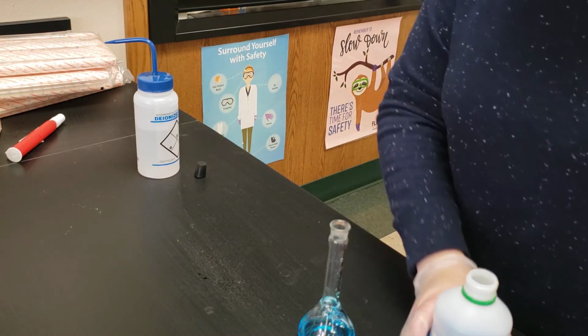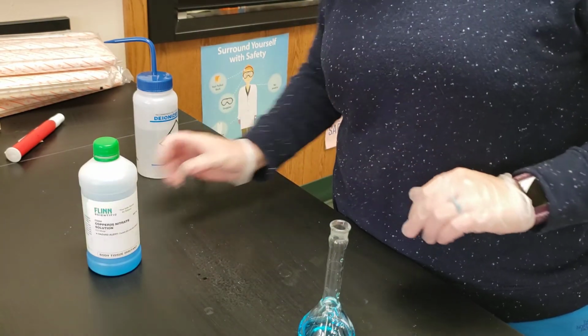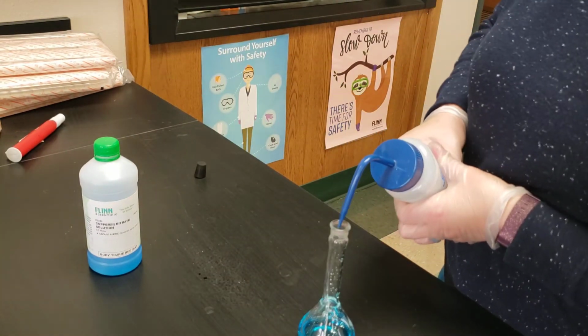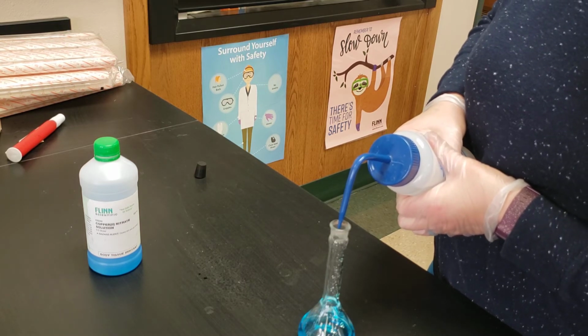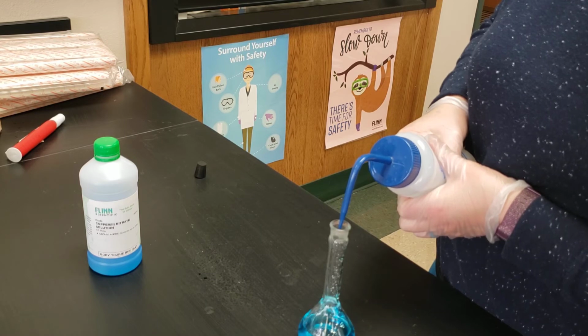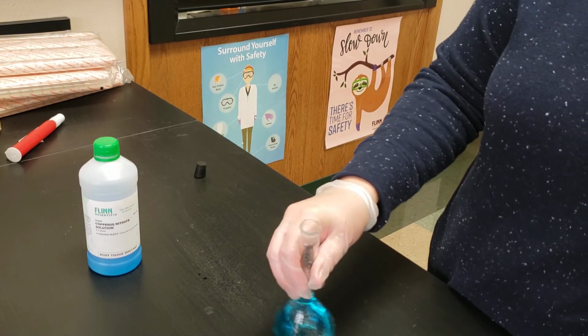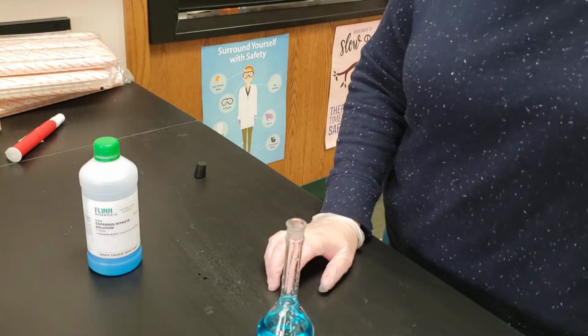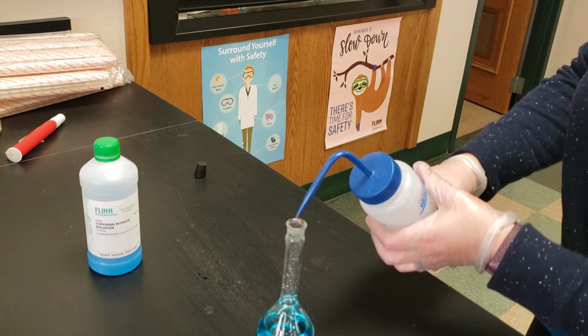Okay, so I've got that in, and now what I need to do is get my solution dissolved. So I am going to put a little bit of water in here. Now this is already an aqueous solution, so it's not too big of a deal. You may notice a little bit of swirling, and that's because of the density. So I'm going to swirl this a little bit to get it to mix. If this were a solid, you'd want to get this solid completely dissolved before you fill it up.